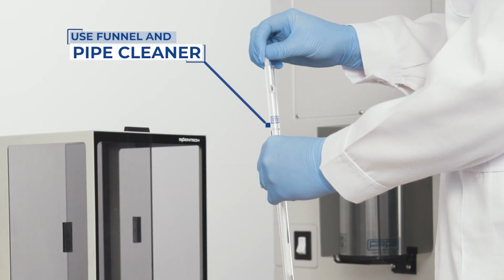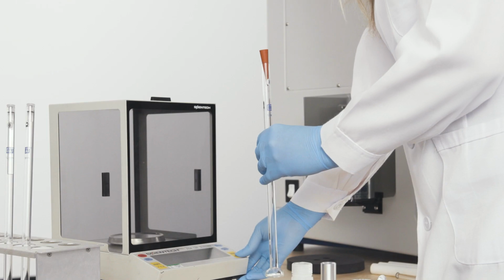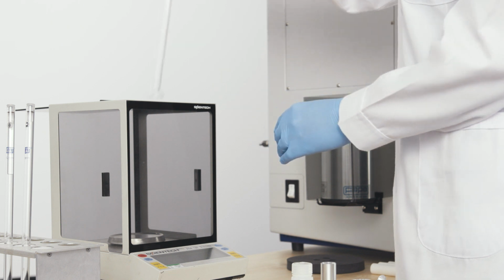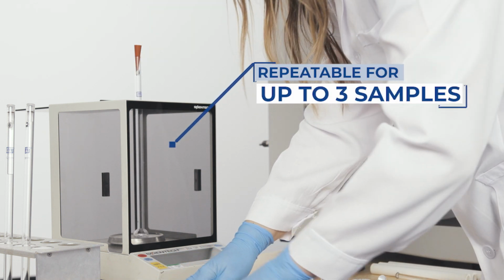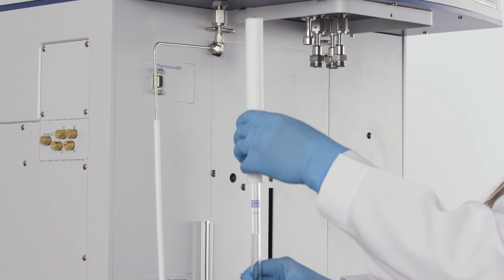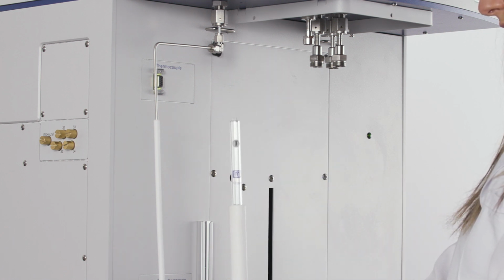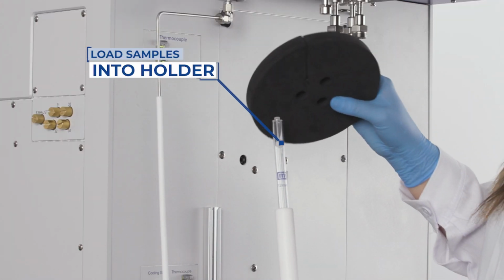Use a pipe cleaner to ensure that no particulates are stuck to the side of the tube. Record the filled sample tube mass. You can repeat this process for up to 3 samples. Next, take the sample tubes to the instrument and place the isothermal jackets onto the sample tubes. Load your sample tubes into the sample holder.